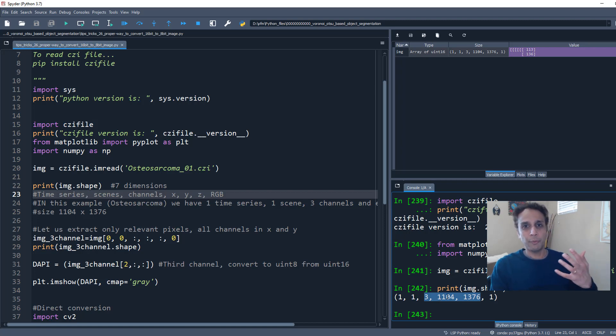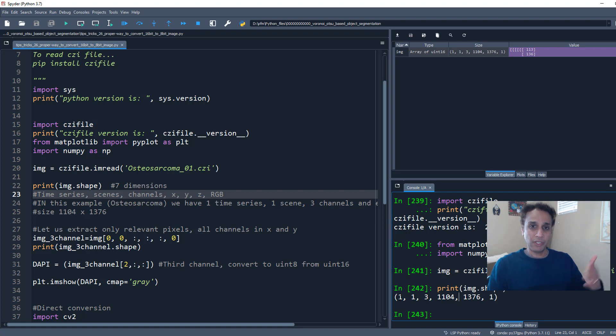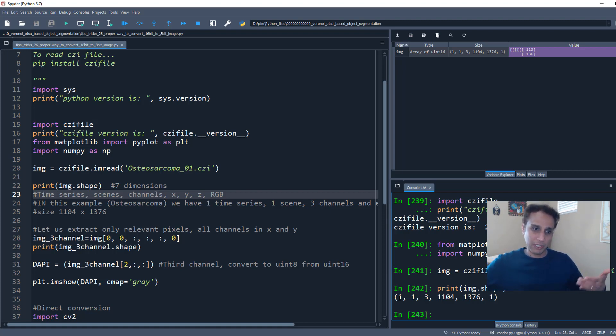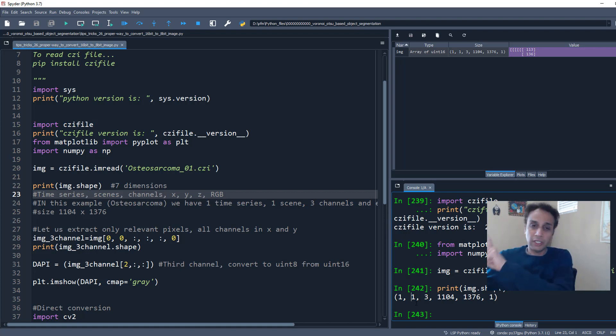1024 by 768 by 3 for an RGB image. For scientific images, especially microscopy images, you may have a time series, not just one image, but the same field. As the time goes by, you take more images. Or it could be different scenes. Hey, scene one here, scene another scene there, another scene somewhere else.